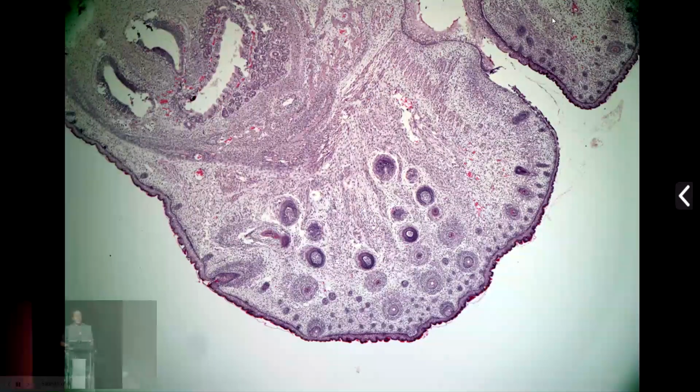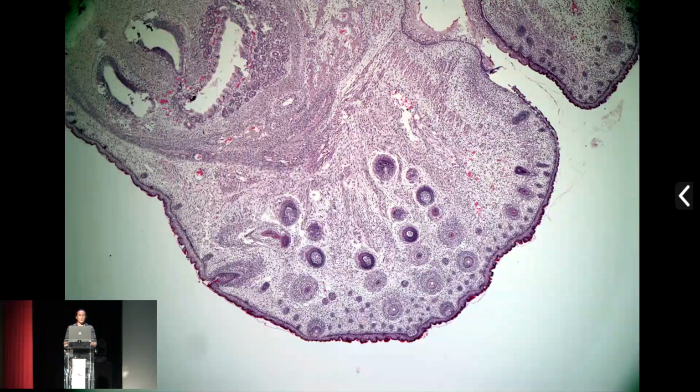We've also been able to use the camera for mesoscale imaging of standard histopathological tissue sections. So using red, green, blue colour contrast, we can do colour imaging, no problem at all. The specimen that we're looking at here is a section through the snout of a mouse embryo at full term. And these circular objects here are the whisker follicles of the vibrissae.